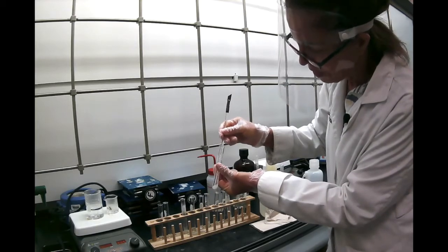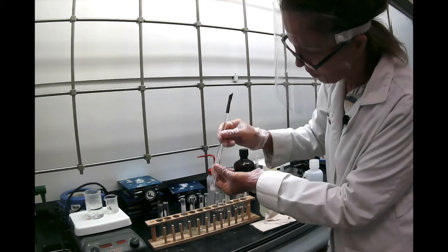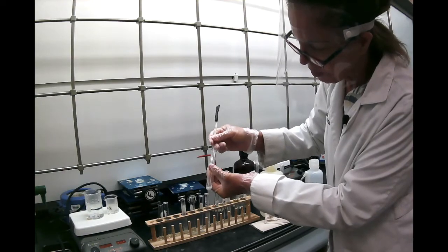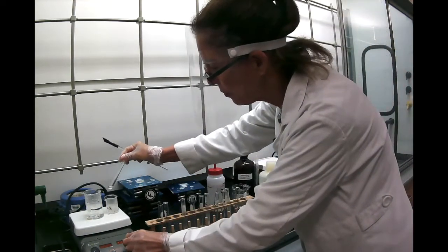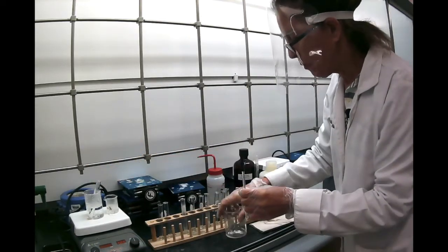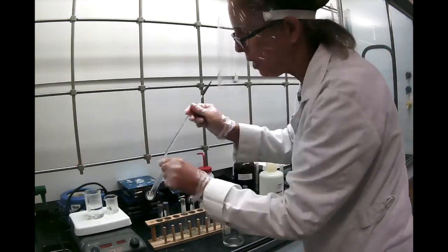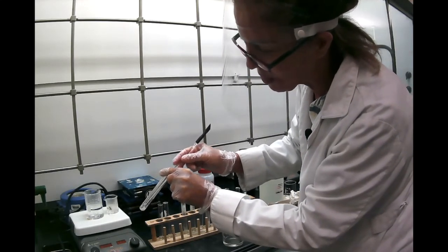Cold petroleum ether, we stir and stir and stir. It's obvious it's not dissolving here. So we're going to put it in the hot water for a little bit. Now, one thing about petroleum ether is it's very volatile, so we don't want to overheat it because it will evaporate, and you can see it did evaporate.